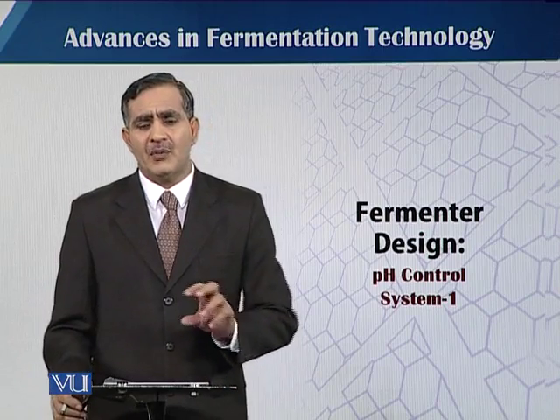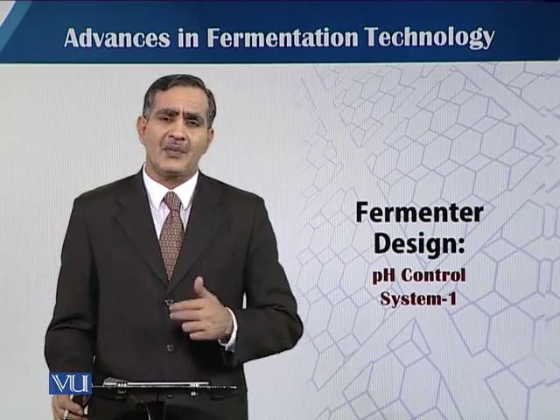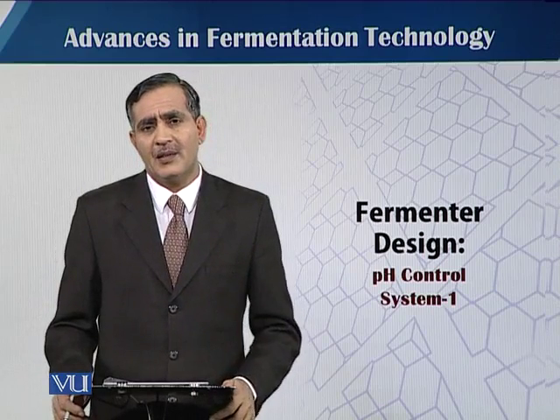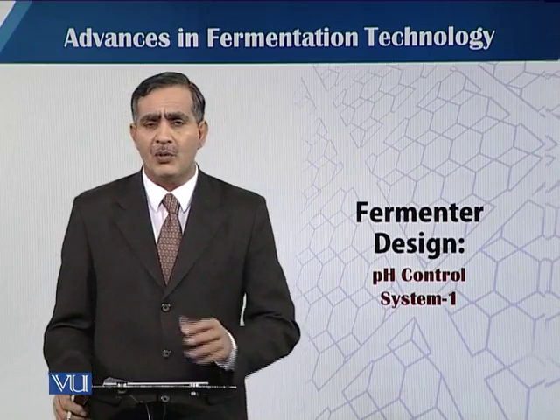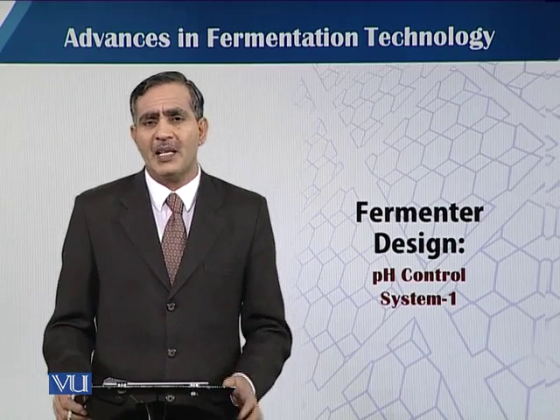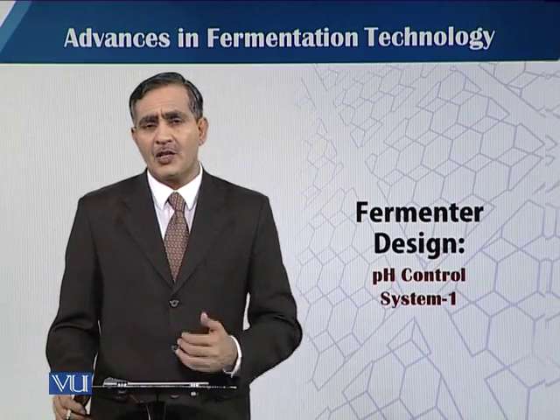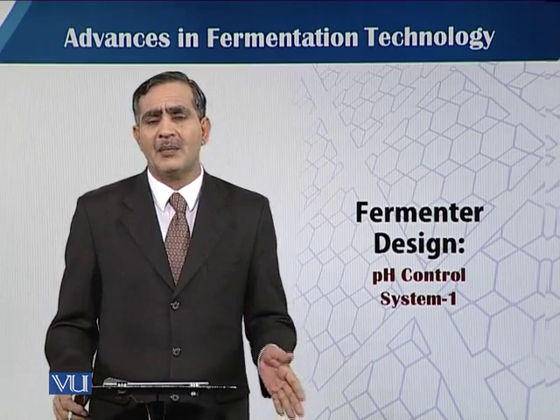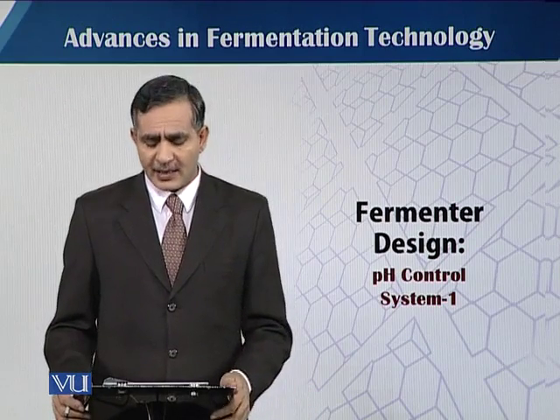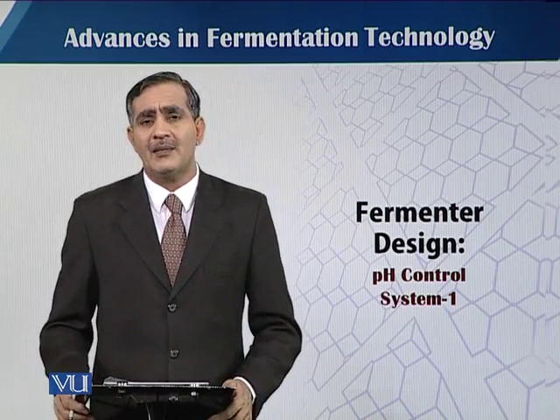Sometimes we have to regulate the pH just for the sake of some desired product. In the case of calcium gluconate and sodium gluconate, we have to keep the pH at 7. Because when there is an automatic run and there is no pH control, there is a gradual change in the pH to the acidic side. So, the pH control system is very critical.